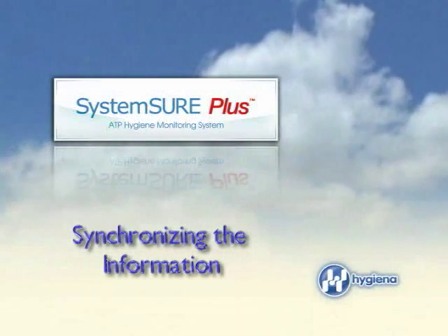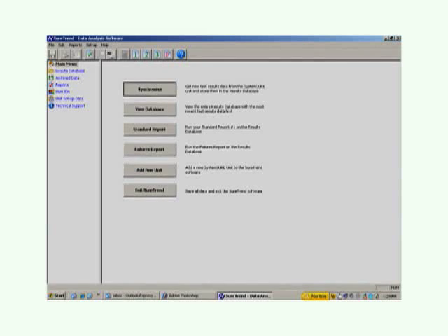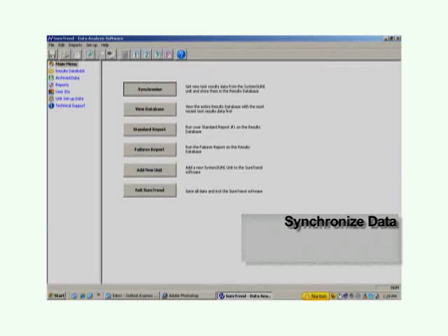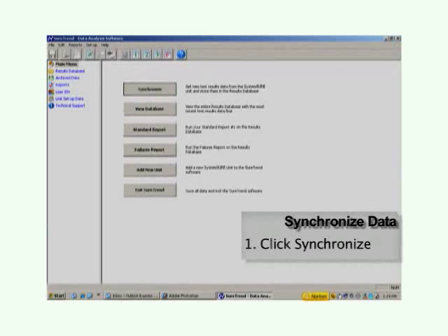Now that everything is set up, it is time to assign the information to your System Sure Plus. To do so, from the main menu just click Synchronize. The information is now being sent to your unit, and you're ready to go.